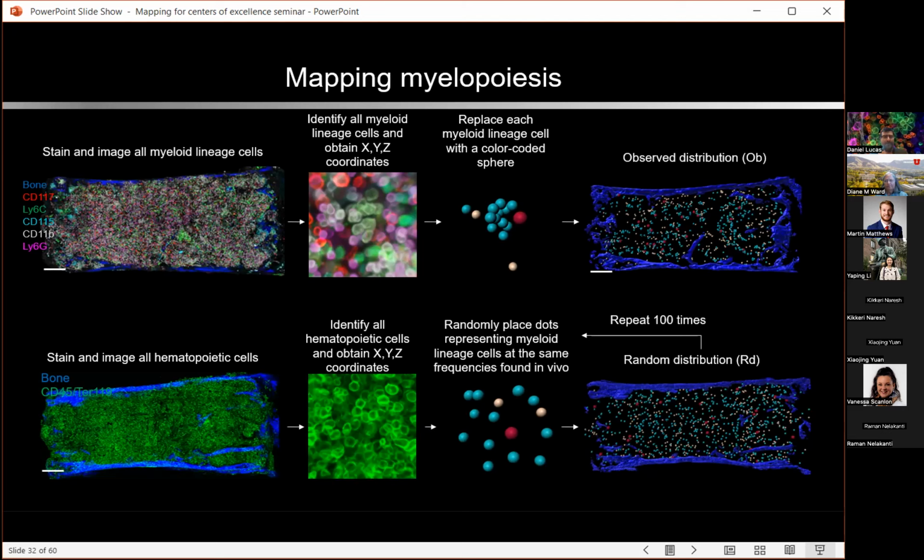So every single one of these markers was an antibody detected by antibodies. So fluorescence conjugated antibodies. Directly conjugated antibodies. Yeah. Okay. And then the second question that's populated is from Carolyn Auchen. I'm sorry if I mispronounced names. Is CD45 TER119 staining superior to DAPI for segmentation?